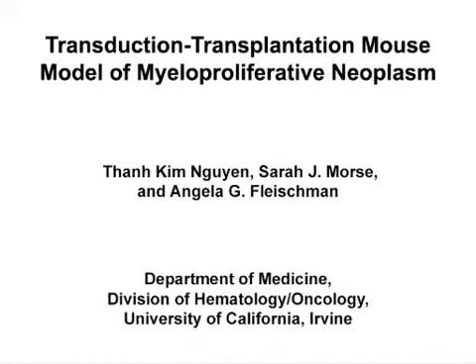The overall goal of this procedure is to generate mice expressing the gene of interest in hematopoietic cells using the transduction transplantation method. Within a short period of time, this method can help answer whether your gene of interest induces a hematologic malignancy. The implications of this technique extend towards therapy or diagnosis of hematological malignancies because of the expedited development of mouse models that can test putative therapeutics.